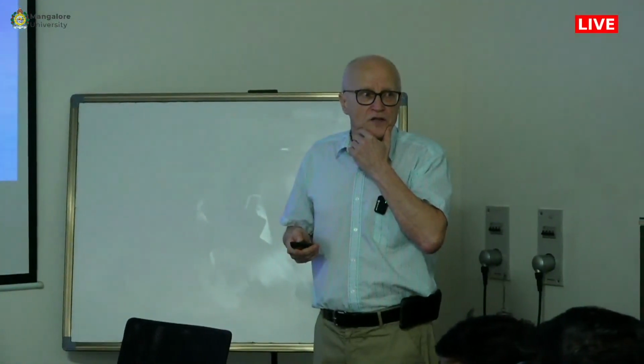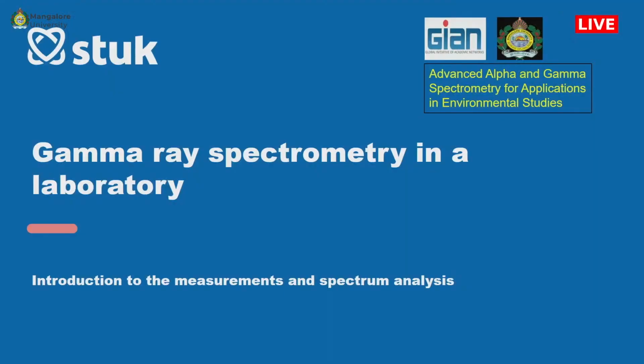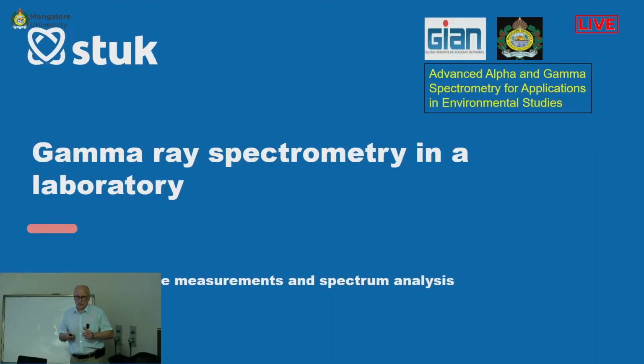You already saw gamma ray spectrometers in the lab. Let's go through in this presentation all those things once more so that you can have a good impression of what happens when we do measurements and spectrum analysis.